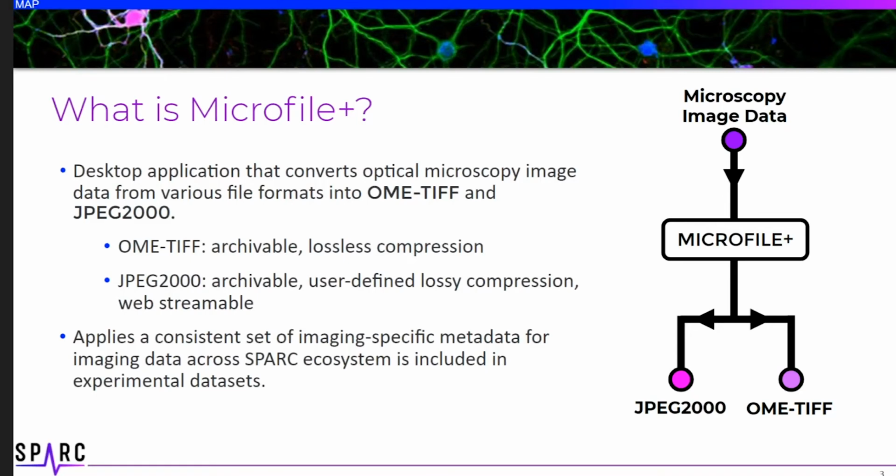Microscopy imaging data is a common experimental modality and is inherently diverse. Variability in experimental sample preparation, as well as microscopy settings, methods, and equipment all contribute to the complexity. By providing a form of the source image data in SPARC datasets as two open formats inclusive of essential metadata, we aim to reduce the barrier for using this image data.